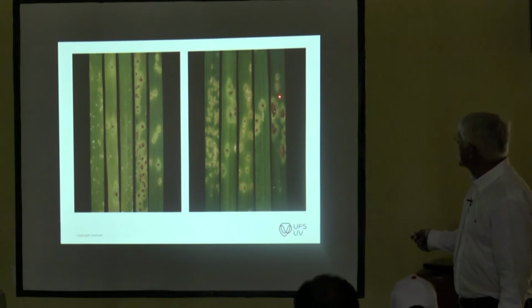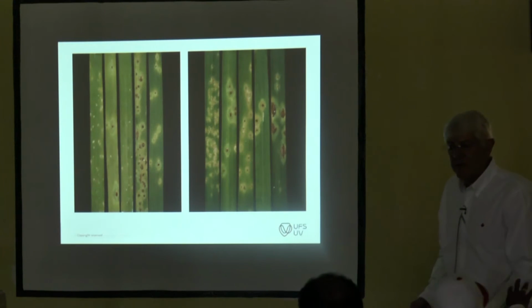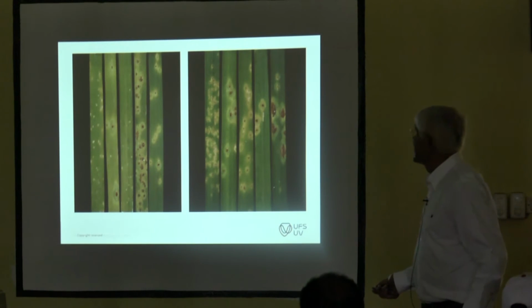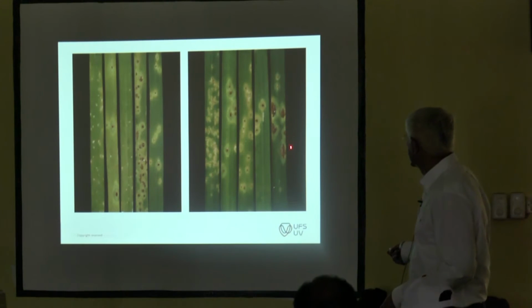What would those two pustules be up there? That not stem rust? It's probably leaf rust contamination. Or a different race, some contamination. But that would be the typical high response.